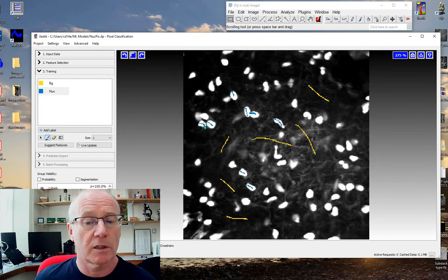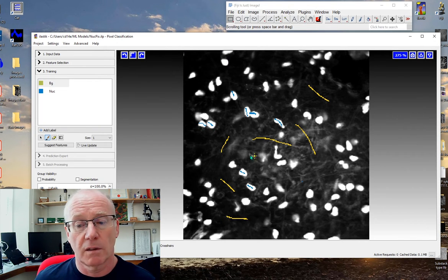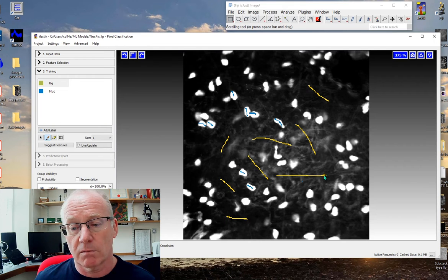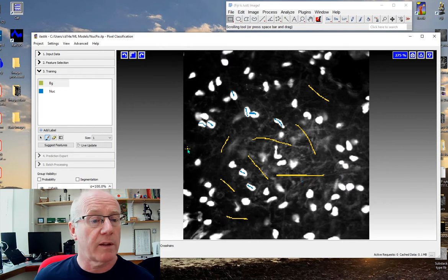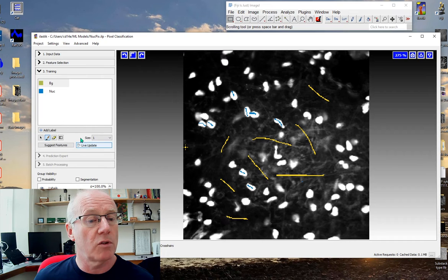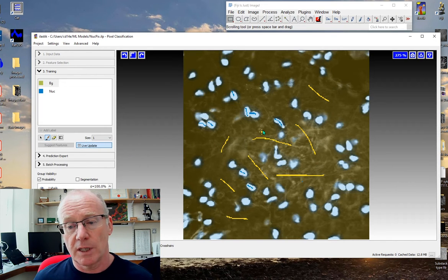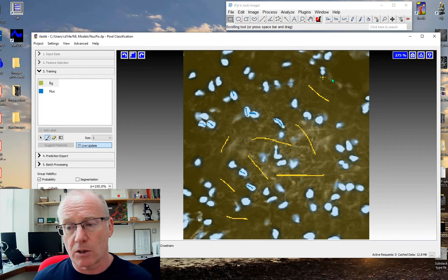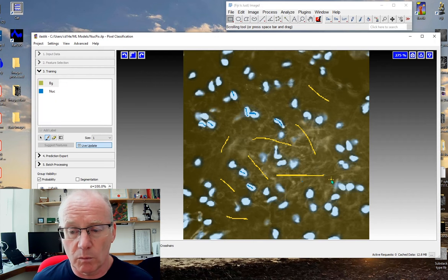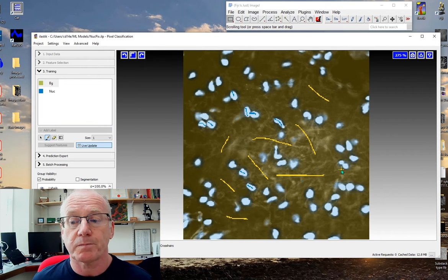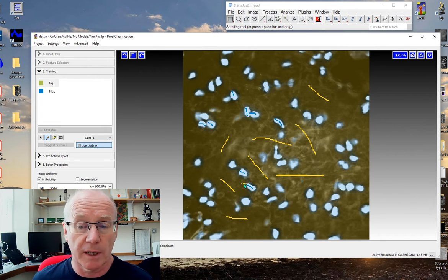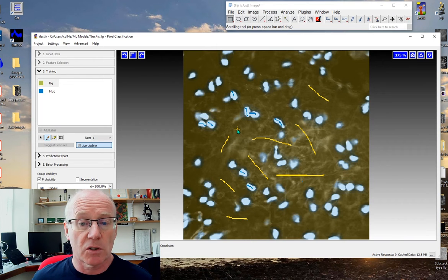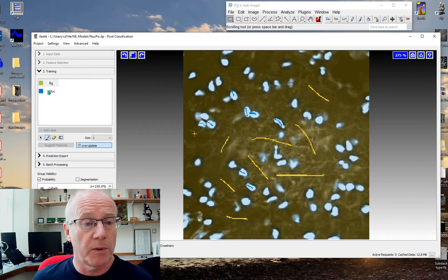Okay we're back on track. That's a nucleus, and that's background. Let's see how it's doing. If we choose live update you'll see that it has a good guess at what it thinks I want in terms of background and objects. I think it's doing a fairly good job there.